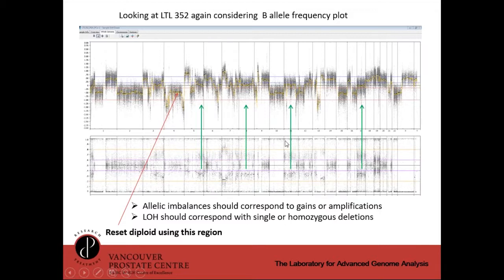And then I've got 4 samples with green arrows here, or 4 examples of allelic imbalance, one here, here, here, here, and those correspond to, if we look up and follow this, they're basically diploid, or they're being called diploid in the copy number plot. And I think with the algorithm that Nexus uses here, it's almost impossible to find these diploid lines. It does the best that it can, but it really doesn't know where to center these things, especially if something biologically strange is happening.